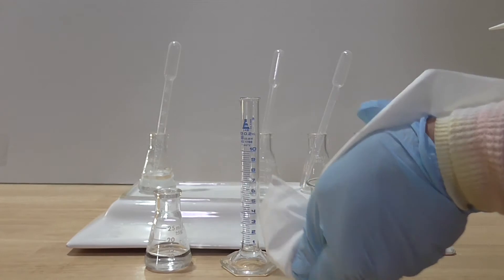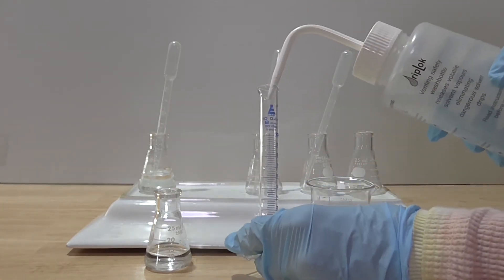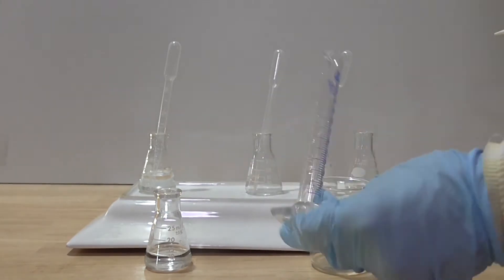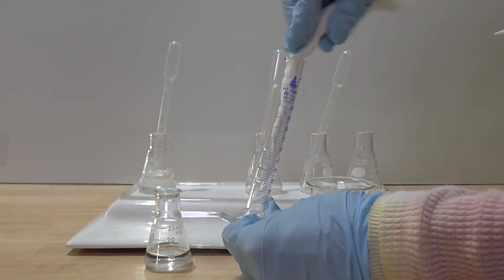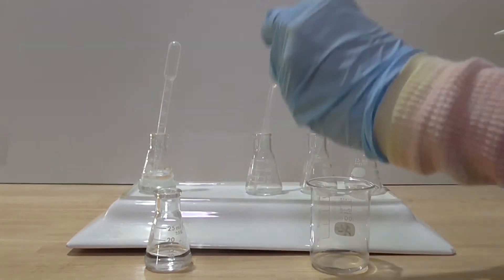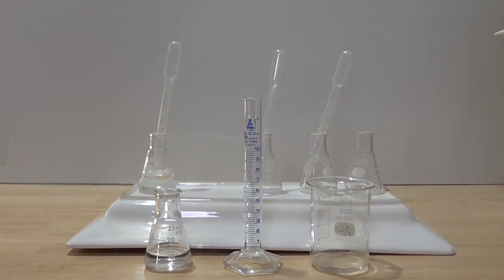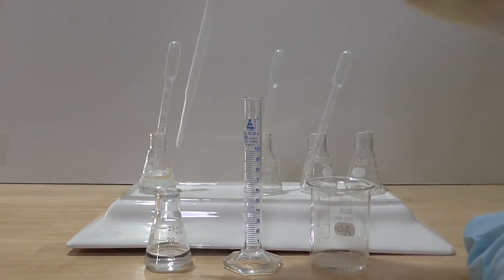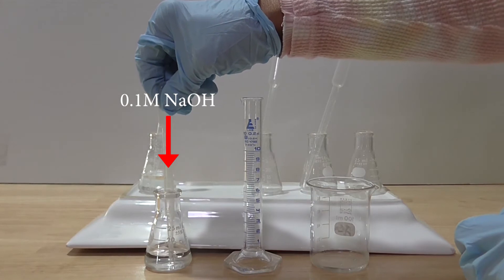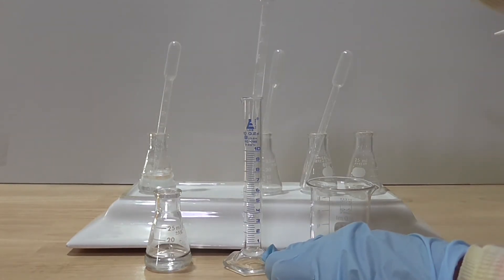I then clean and dry the measuring cylinder. I am now ready for my next dilution. I use a clean dry plastic pipette to transfer one milliliter of the 0.1 molar sodium hydroxide into the clean dry measuring cylinder.